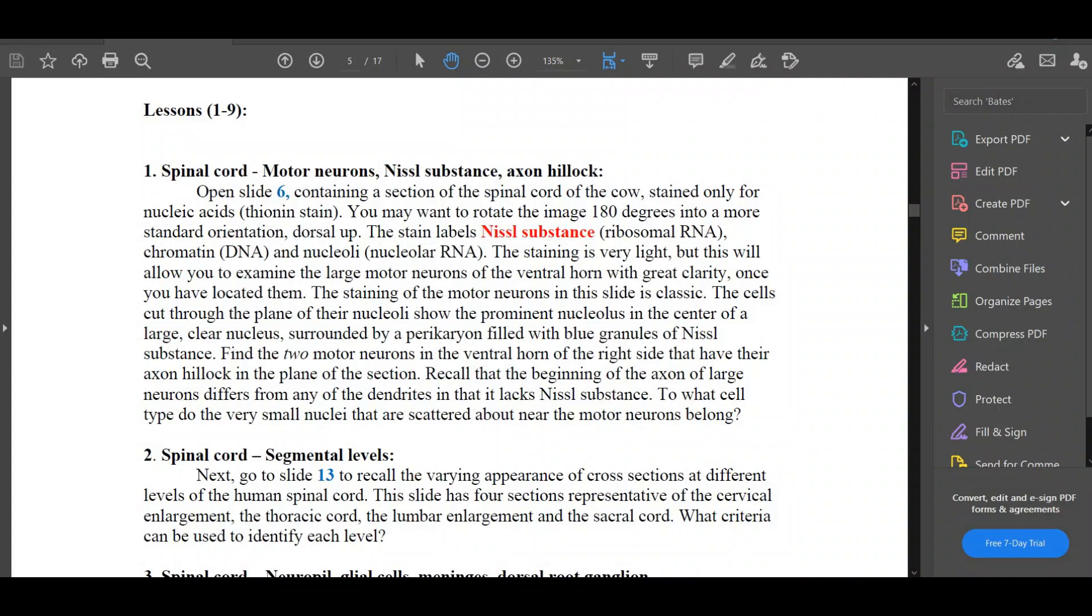Hey everybody, I've got one more Unit 6 histology review video for you. This will be on the neurohistology of the brain and the spinal cord. There are a lot of slides to go through, so I'm going to go one by one, and I'm going to follow the order that's in the lab manual.